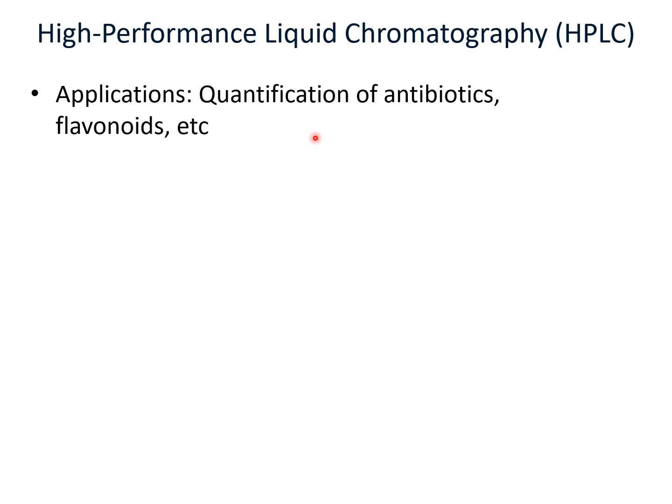However, just like thin layer chromatography, HPLC quantification or detection requires the presence of a known component. That is to say, a known, commercially available standard is used as a reference to detect and quantify an unknown component using the HPLC system.